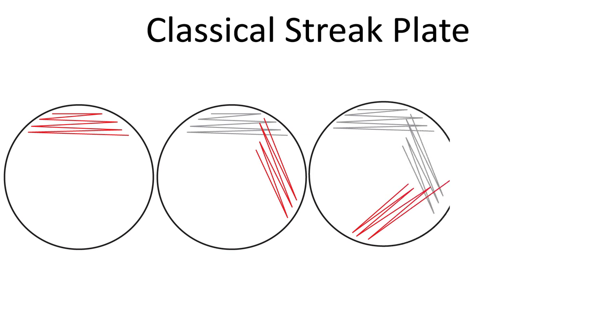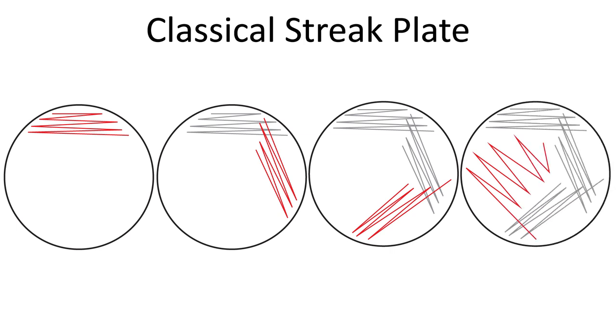Flame your loop and repeat this a third time but this time crossing the second streak and then a fourth time crossing the last streak. And every time you do this you're basically picking up a small amount of yeast and moving it over and putting it on to the next section of the plate.